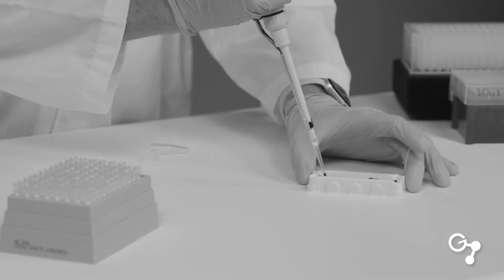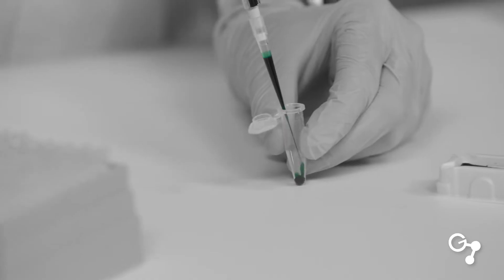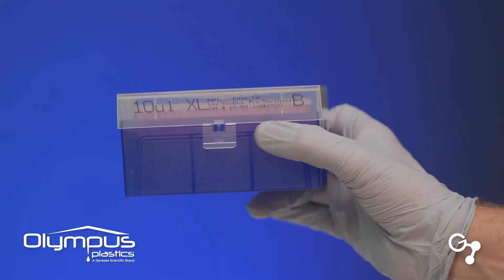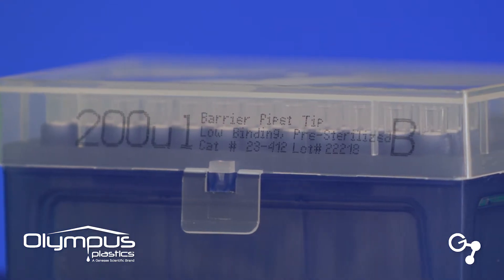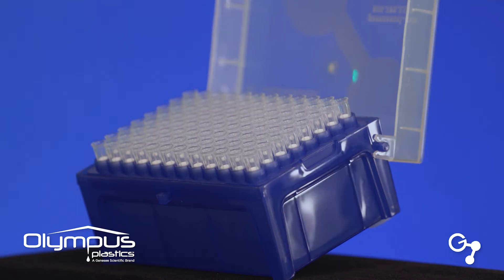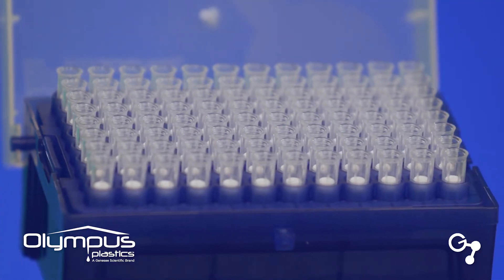Are you tired of losing valuable samples in pipette tips that don't produce consistent results? Genesee Scientific's Olympus Premium Barrier Tips are designed to help ensure your measurements are accurate, reduce sample loss, and save reagent cost.